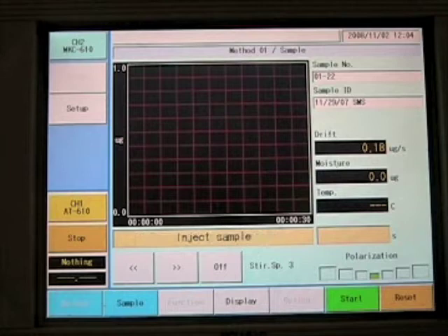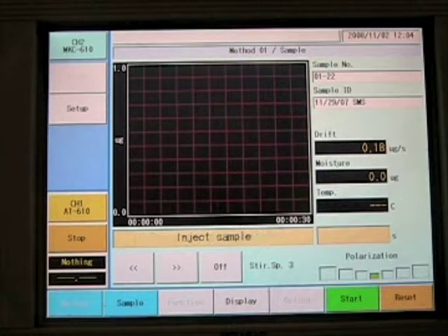As well as the ability to control two separate titrators simultaneously. By simply touching the screen the operator can toggle back and forth between titrators.